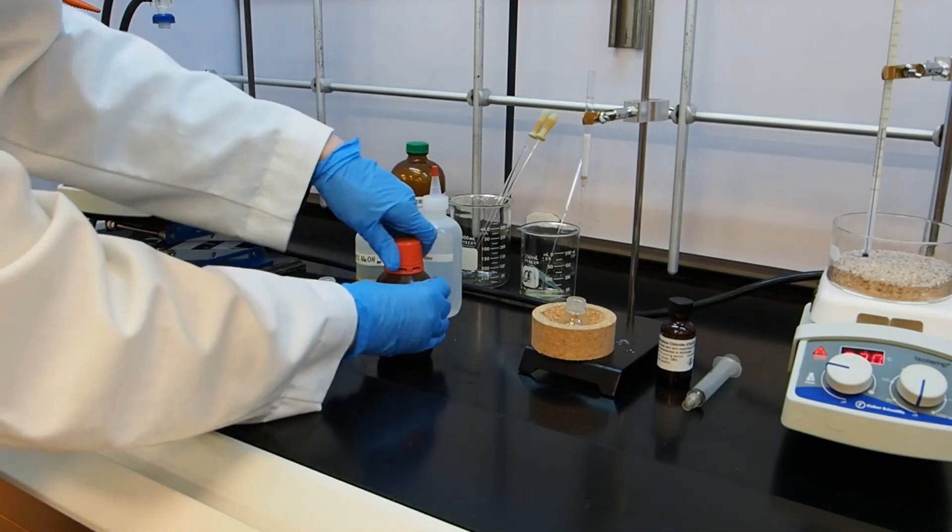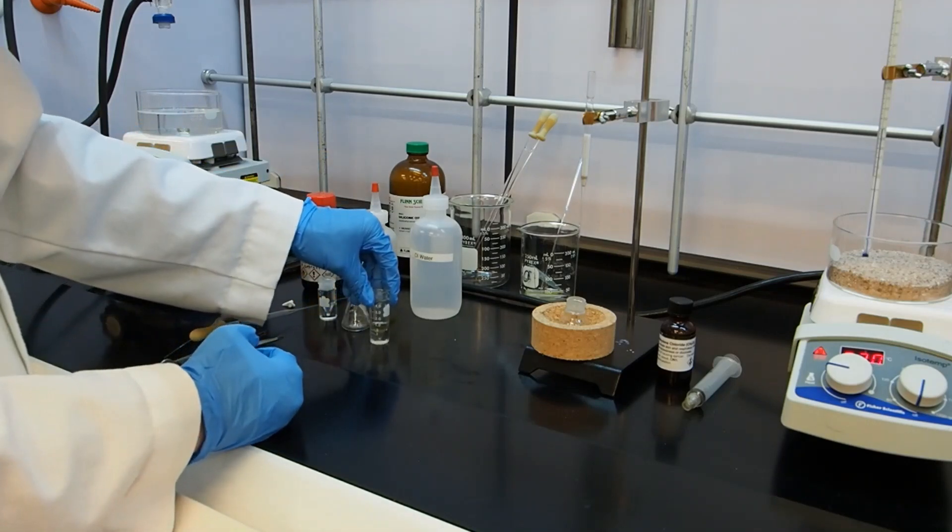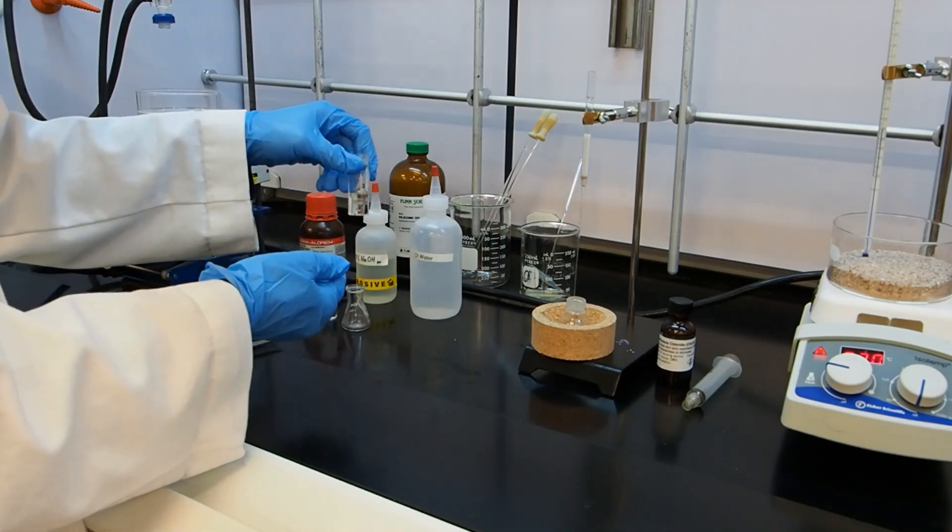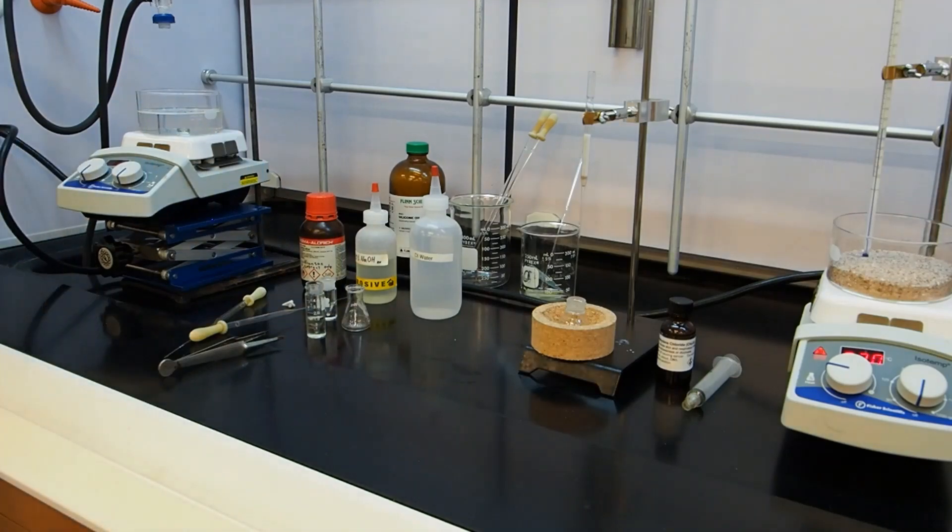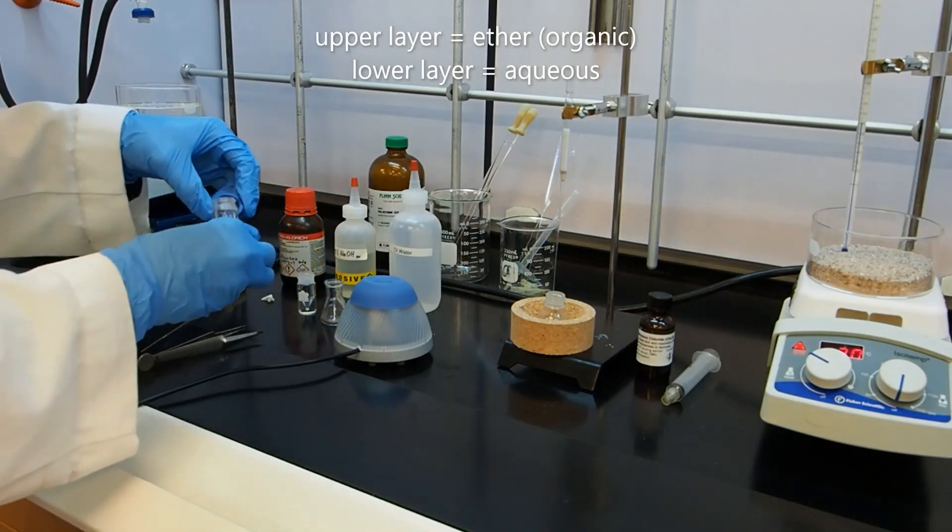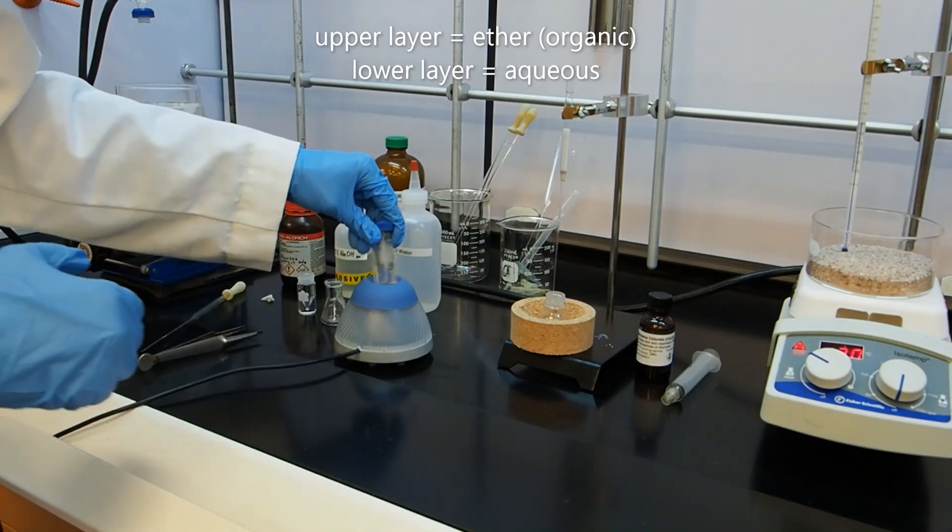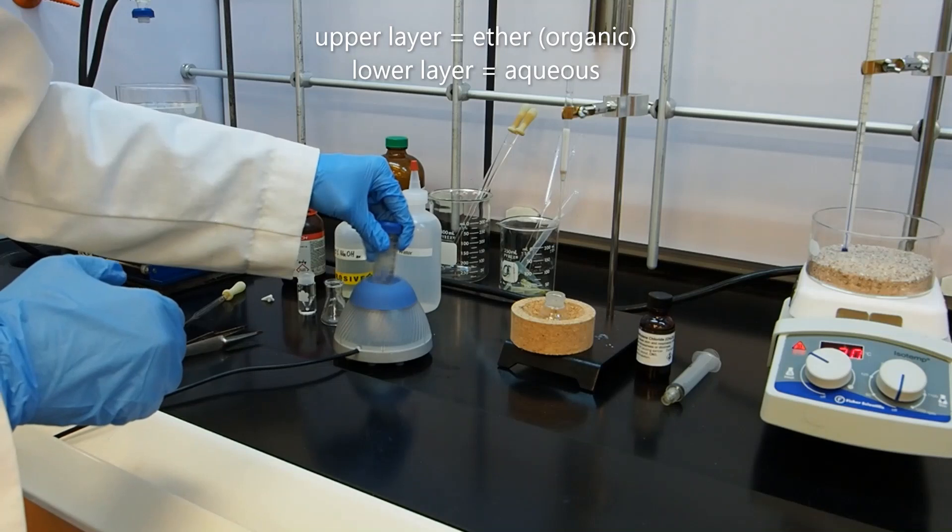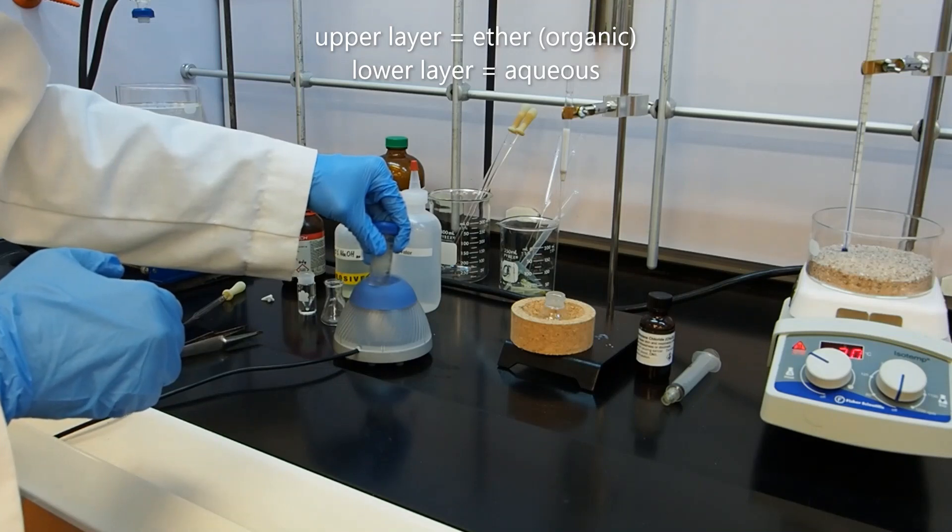At this point, we should definitely have two layers because our original reaction solvent was water and now we've added the ether to it. The ether has a lower density than water, so it should be the top layer. So now that we have two layers, we're going to cap the vial and we're going to vortex it to ensure that there is as much interaction between the two layers as possible.